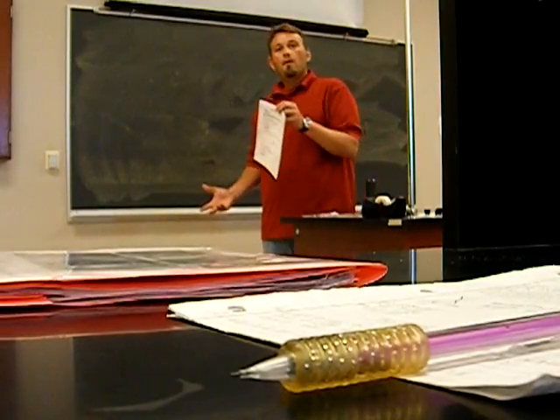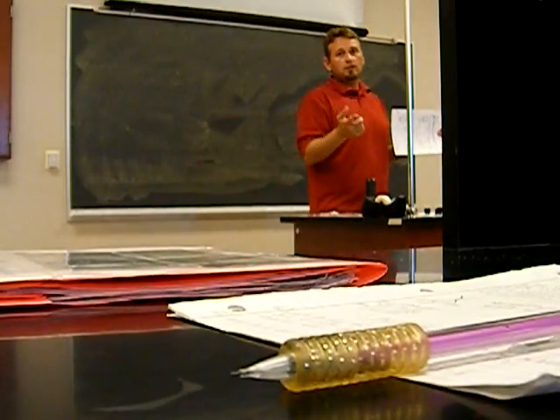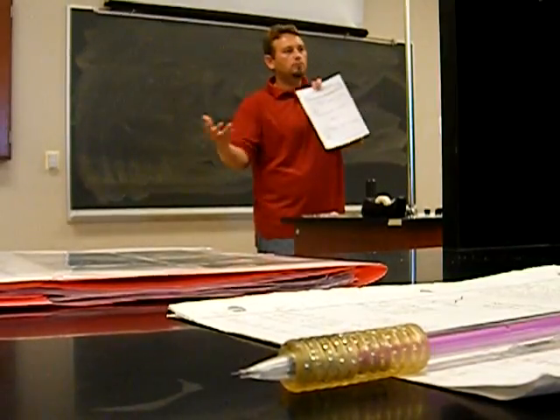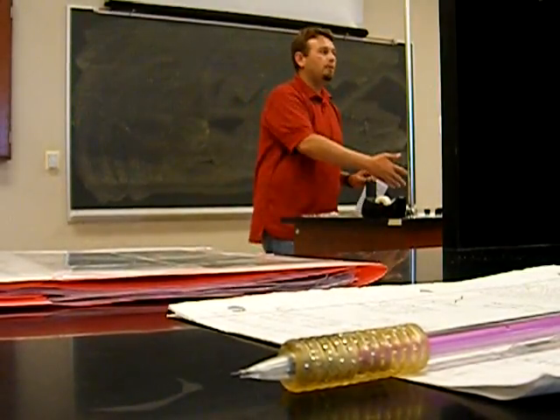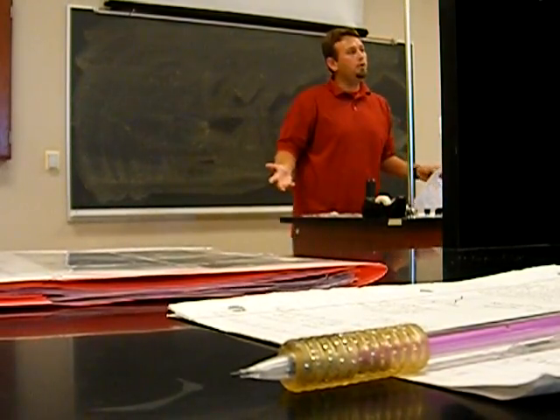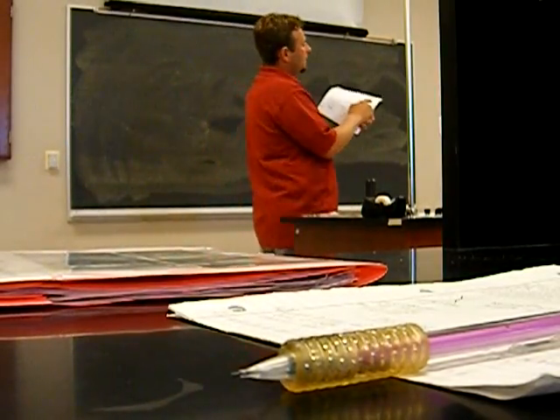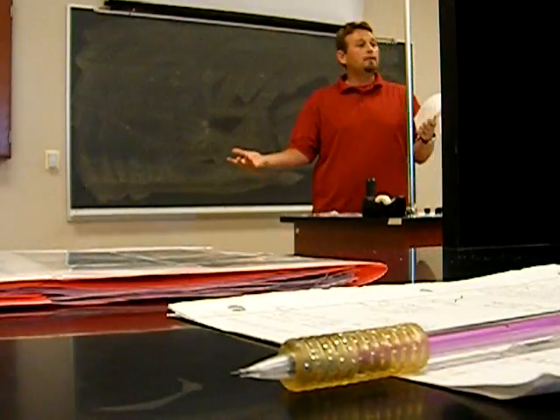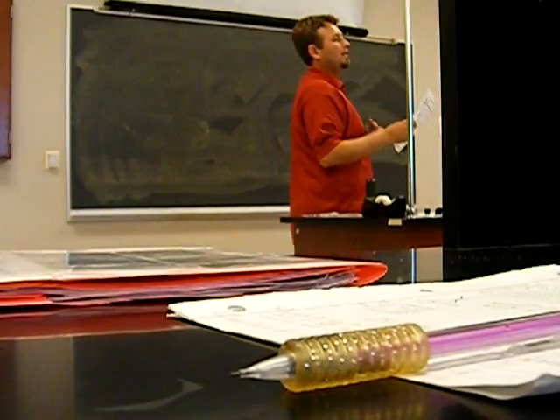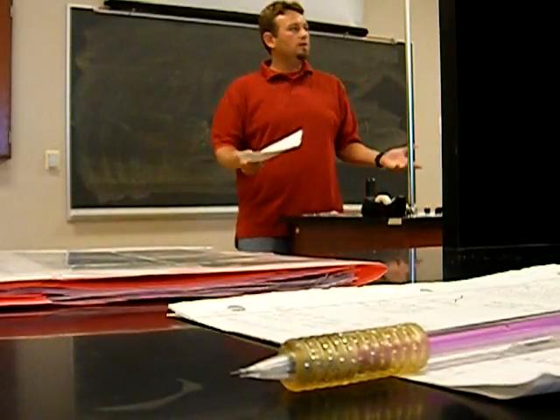Do I have to do like sometimes like 2? Yeah, if there's more than one piece of evidence that there's a chemical change, you have your observations. You have to make conclusions. Okay, well, this is what I saw, so this was probably a positive test. A precipitate formed and it turned from red to green. That's probably a good indication that a chemical reaction took place. That's a positive test. Okay, so for all of them, some of them they all might react, some of them none of them might react. Okay, so you have to either tell me positive or negative, and then if it was positive, why? What happened? What were the observations that made you think there was a chemical reaction?